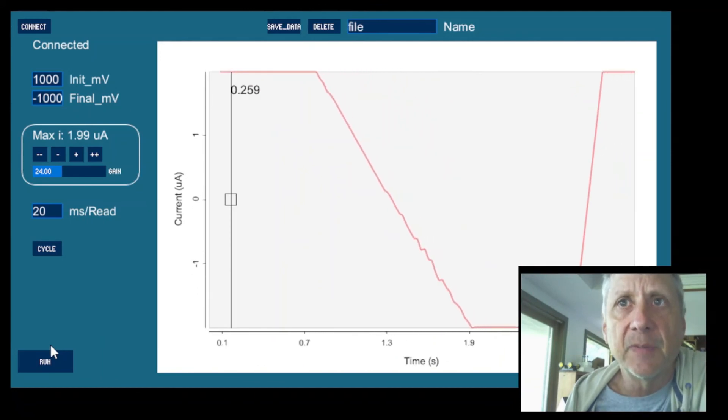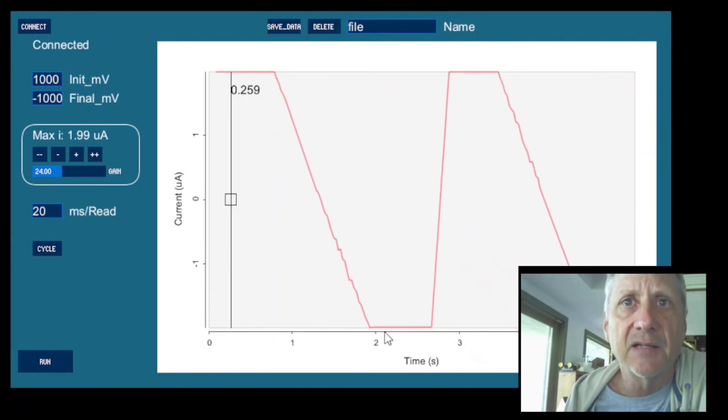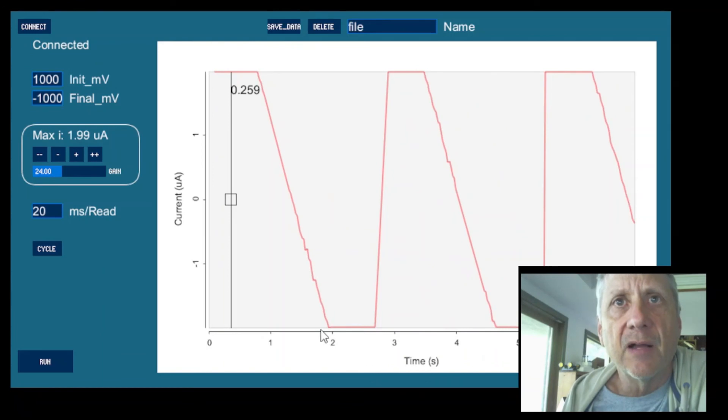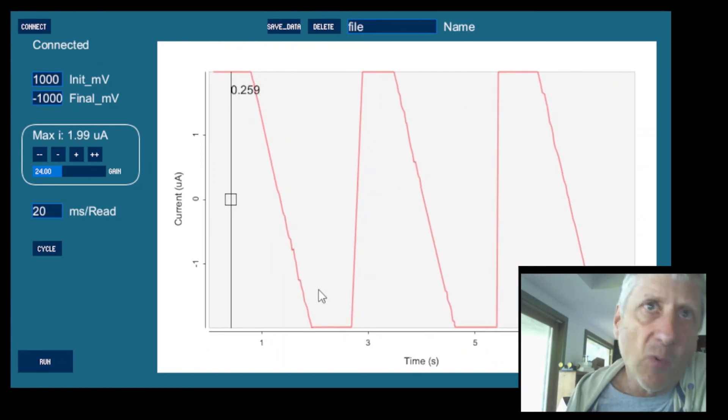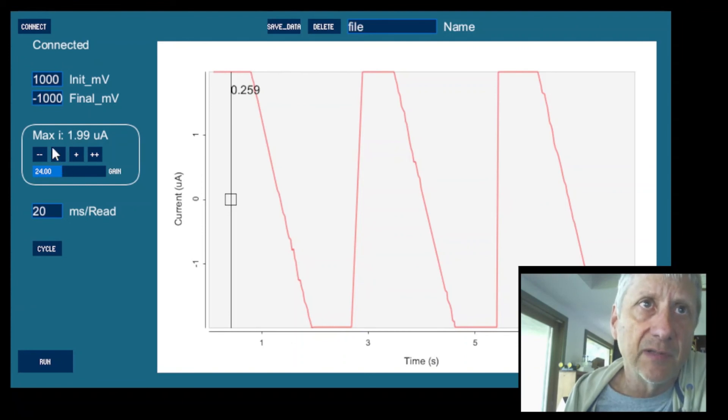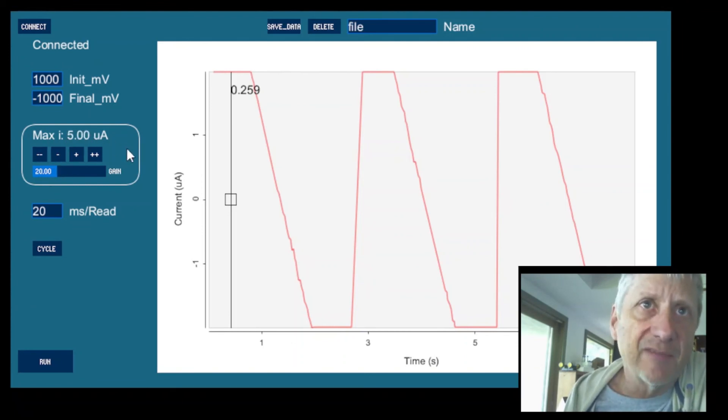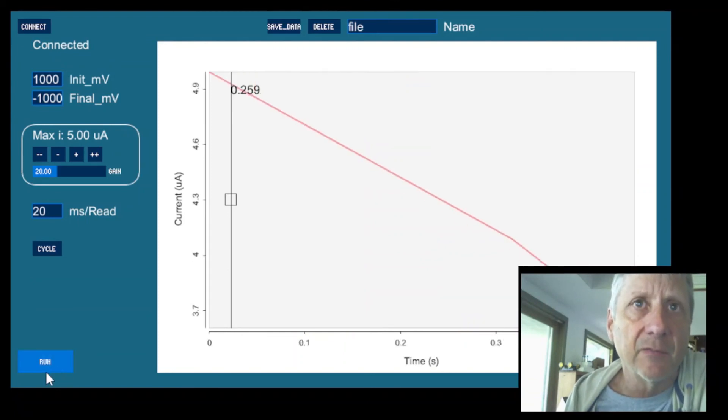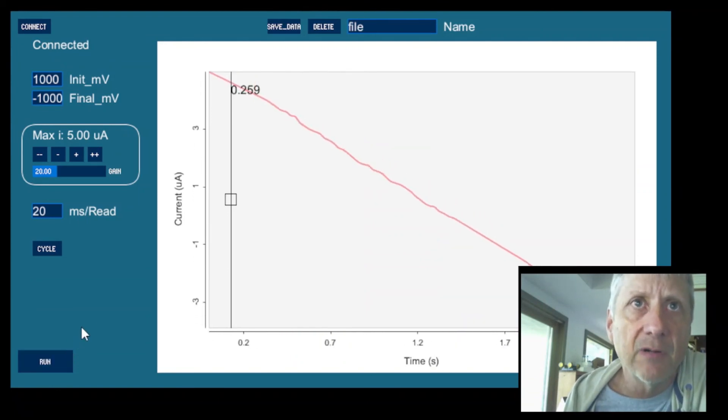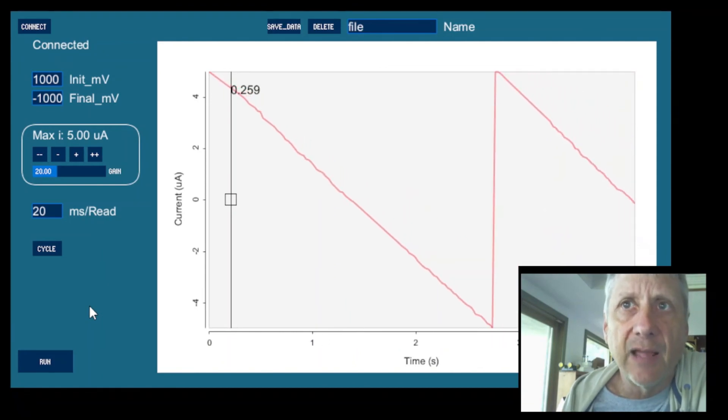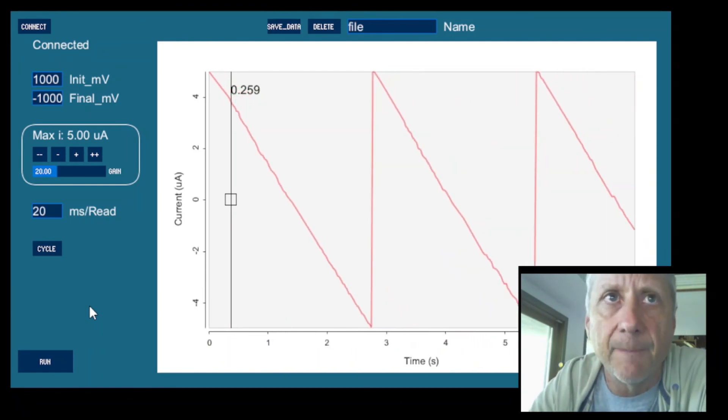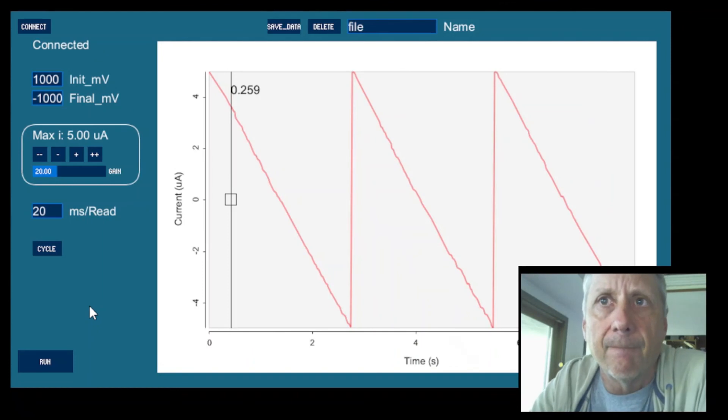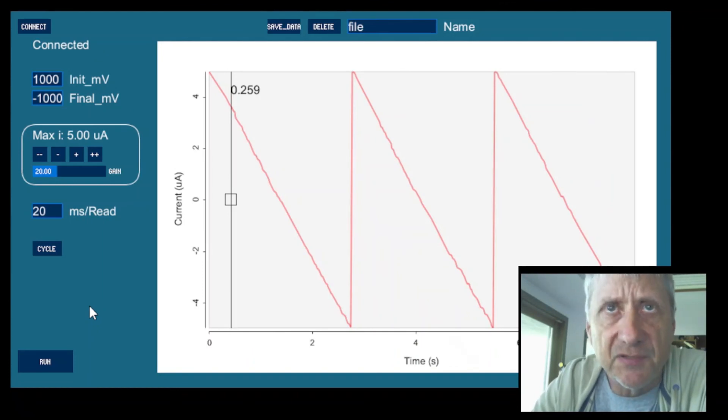So let's run down some of those and let's hit the button again and see how it does. We're still clipping the data, but not as bad because we have more flat area and more data that's being recorded. So let's run it a few more times and five microamps will be our max. Now hitting the run button. And now we're dropping down and we have what's looking like good sawtooth behavior.